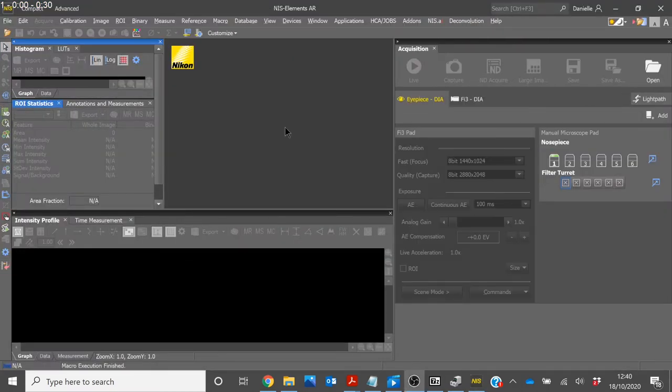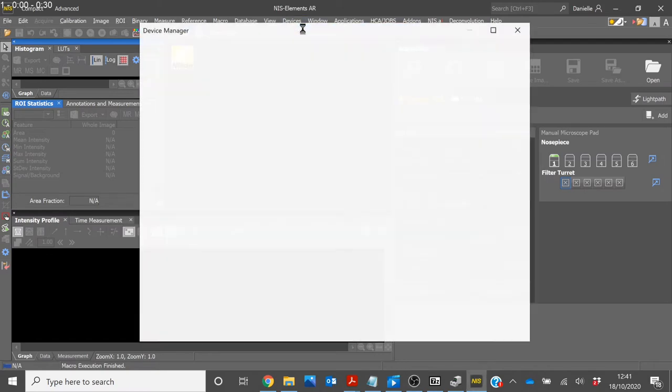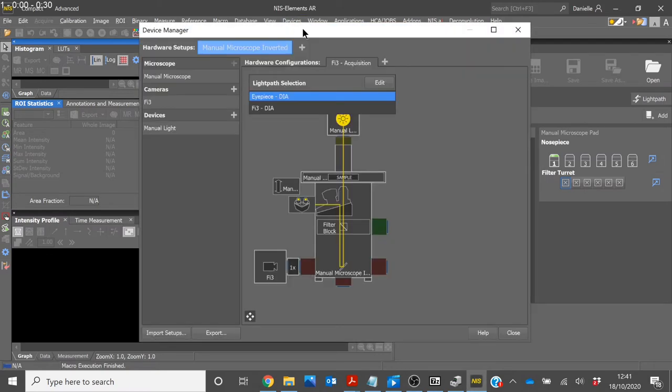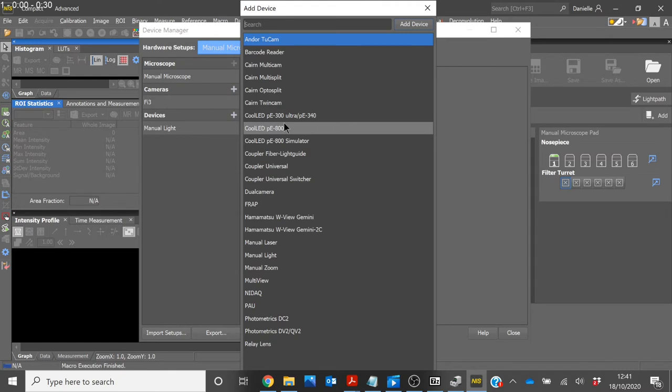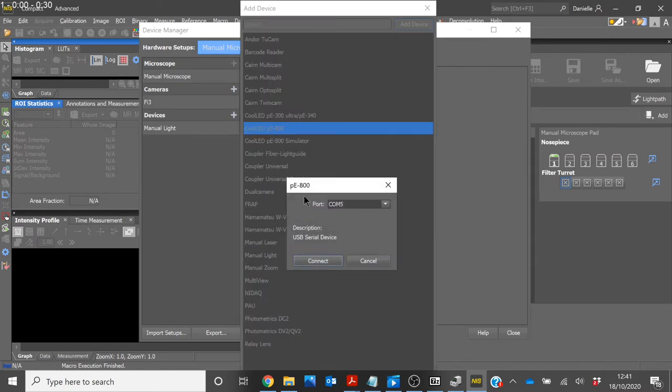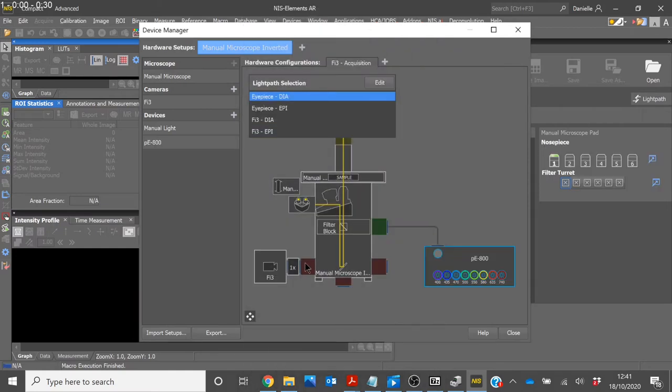Once NIS has loaded, you will first need to head to Devices and select Device Manager. Here we will need to add the PE800 under Devices. Ensure that the COM port is the same as you saw earlier under Device Manager and then click Connect. You can see here that the PE800 has been recognized.